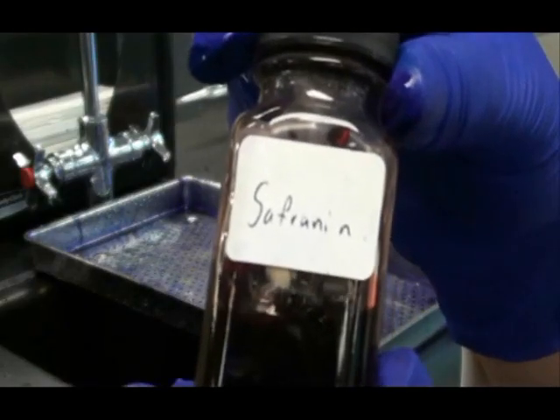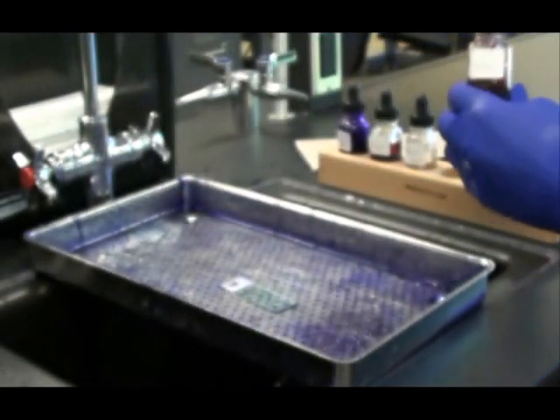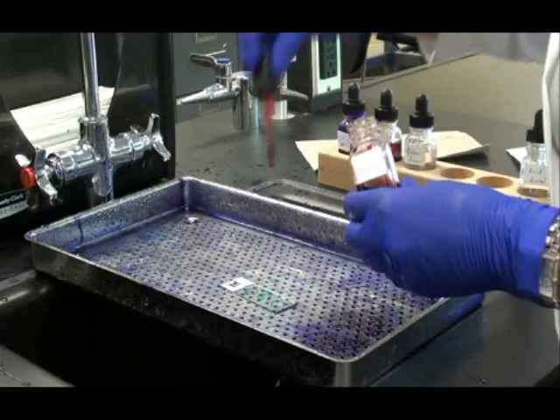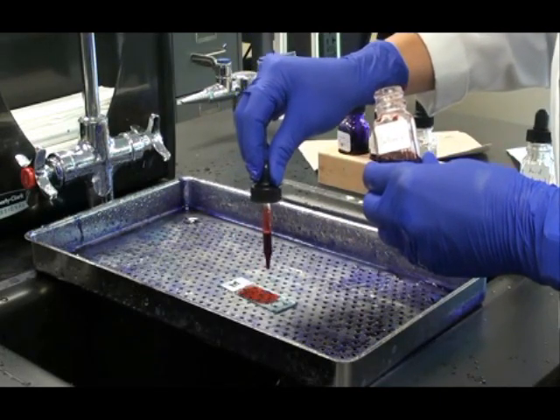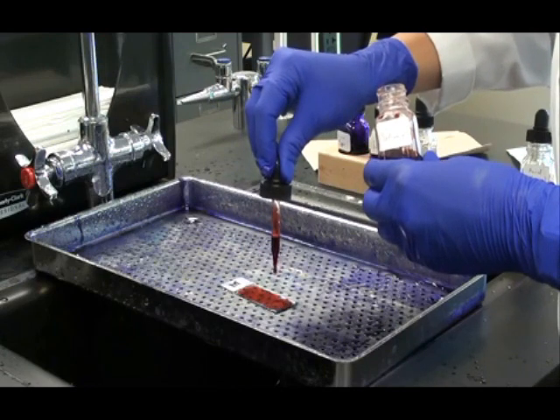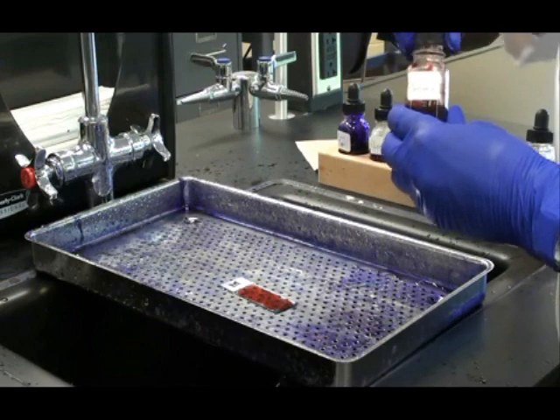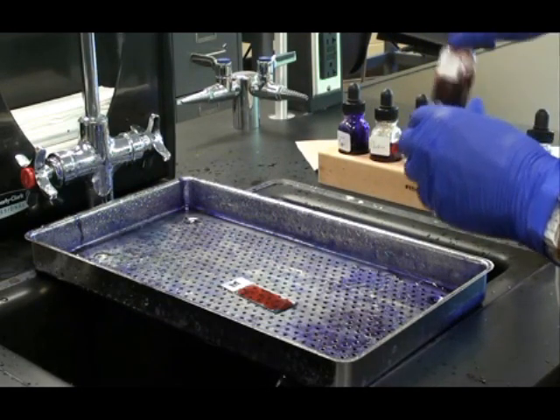The malachite green was used to stain the endospores. The counter stain safranin is used to stain the bacterial cells a contrasting color. Once I've applied the safranin to cover all three circles — all three bacterial smears — I wait one minute.